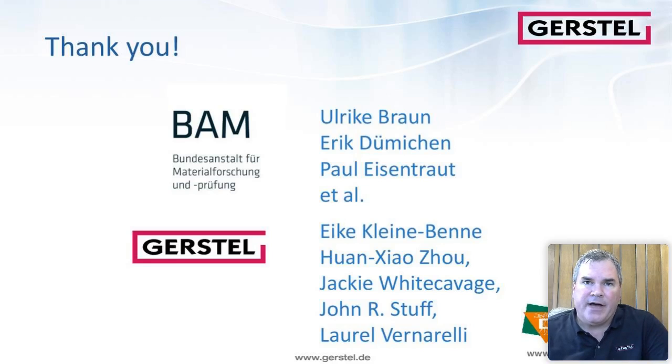They have reference materials, BAM does, that they provide that have been and are currently being used in round robin studies inside Europe to prove the validity of the method. So I guess the best answer to your question, rather than talking about the details, is to go back to the round robin, and that its quantification is successful because the round robin certification data is proving it out that way. But in terms of the details of how it was best worked out, I'd love to connect you with the right people.